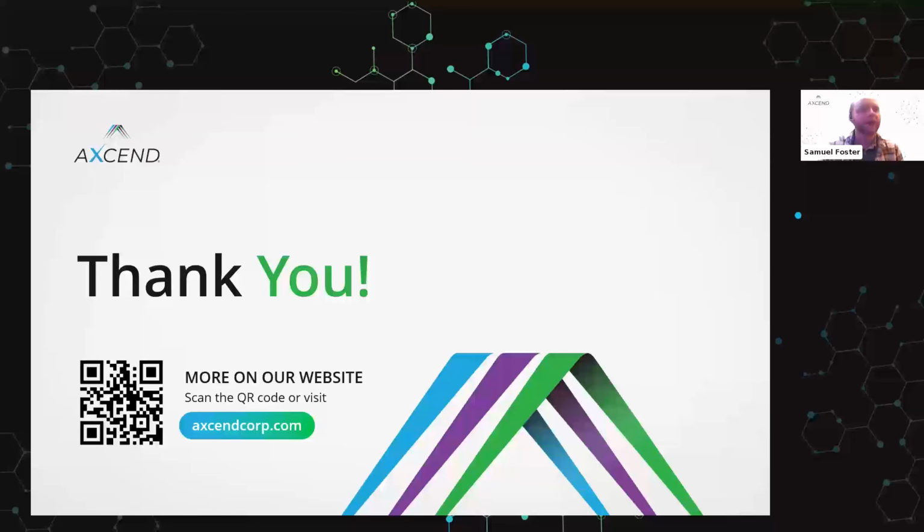Looks like we got another one here. How do matrix effects play out at capillary scale? Are they generally reduced or just different? The answer there depends on a lot of factors. Typically, matrix effects are a lot lower when you get to these smaller scales, as we had talked about. They aren't completely gone, and it depends again on your evaporation process, your analyte, and things like that. But in general, and I say that shakily, you're going to see a slight reduction or a reduction.